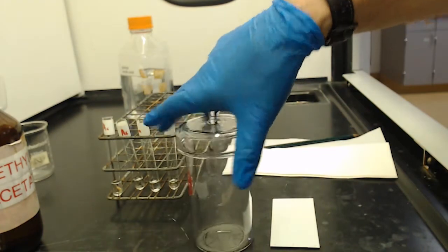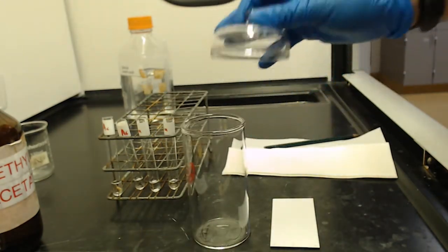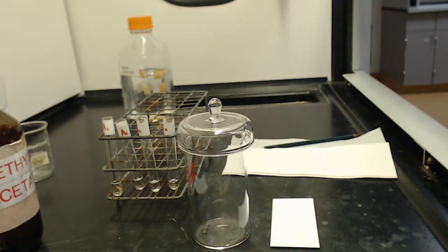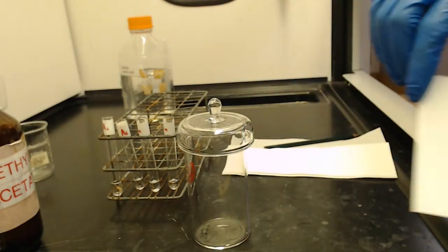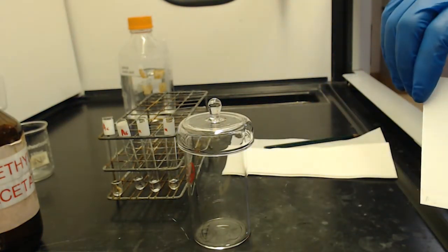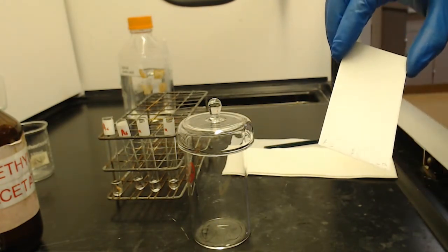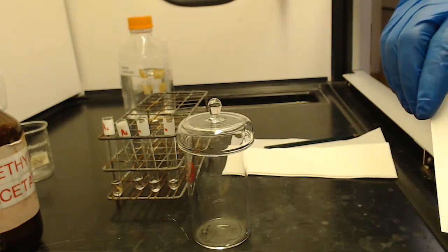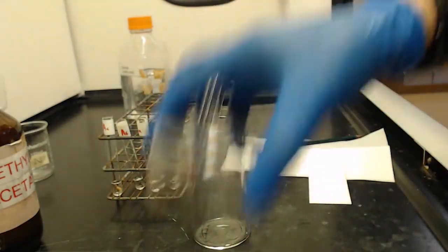So here's your TLC chamber. It's basically a beaker with a watch glass, essentially. When you put your TLC solvent in here, you need to make sure that the height of the solvent is below where that line is going to be when you put the plate in. You don't want the solvent level to be touching that line, because then it's going to mix up all your spots. To get good chromatographic separation, you need to make sure your solvent level is below that line. That's the first thing I check before I run anything, that I have the right solvent level.